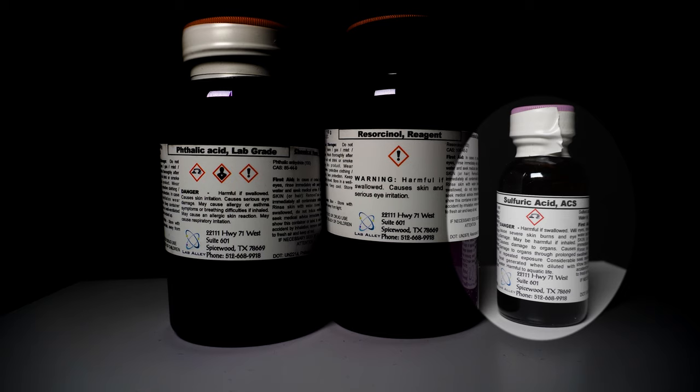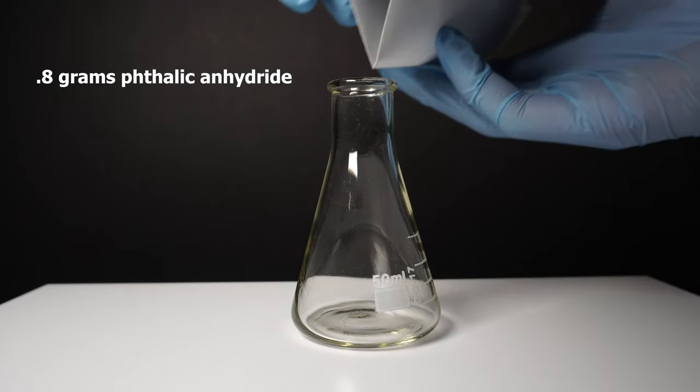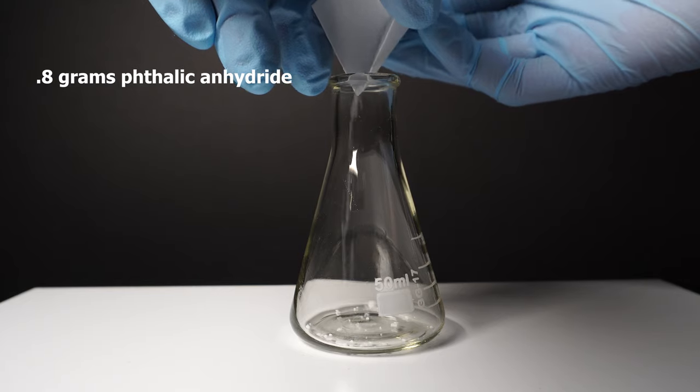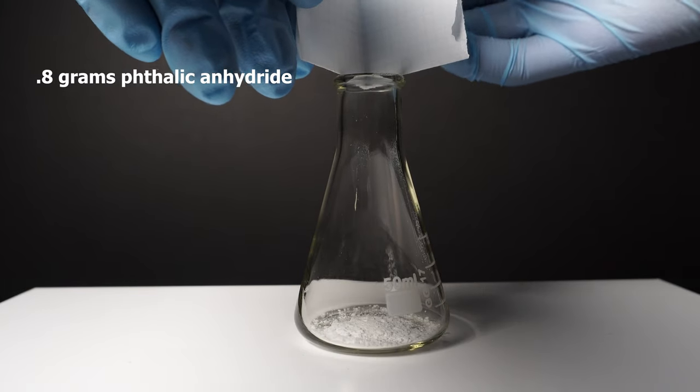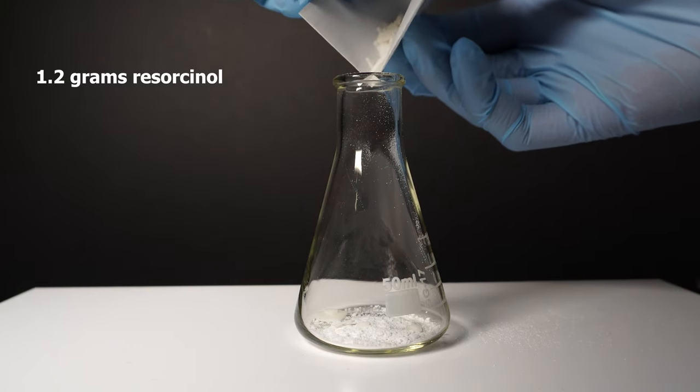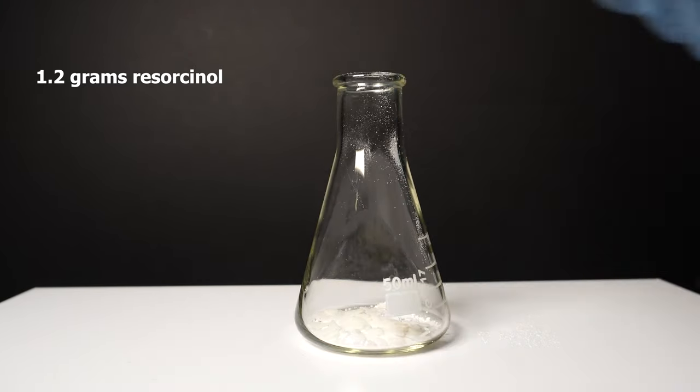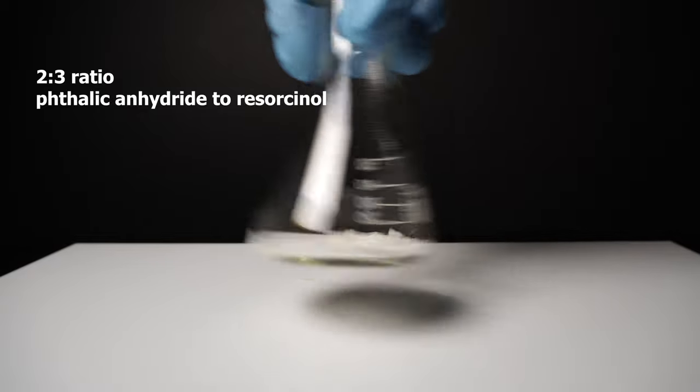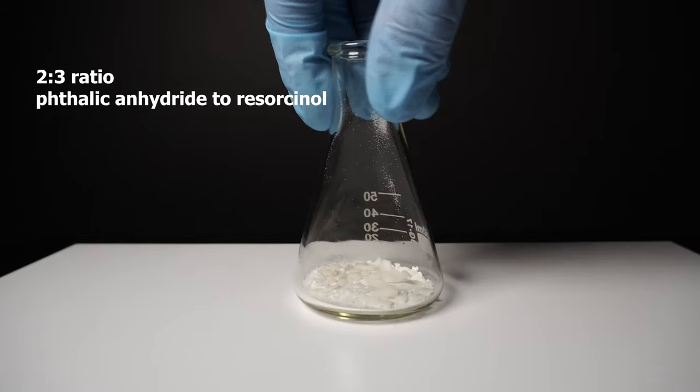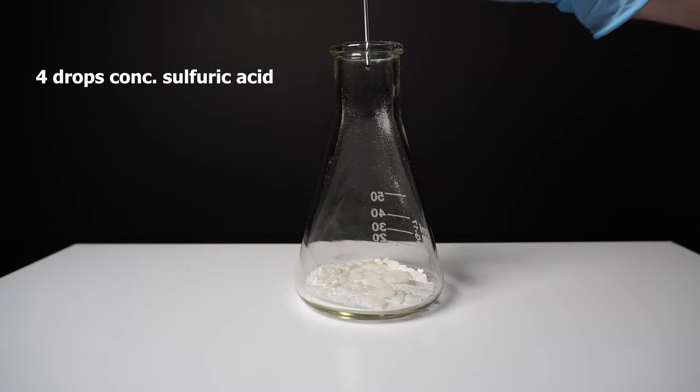However, in most papers I have read, they actually use zinc chloride instead. We start by adding 0.8 grams of phthalic anhydride to a 50 milliliter Erlenmeyer flask, followed by 1.2 grams of resorcinol. The amounts can be scaled up or down depending on how much you want to make. Just make sure to keep about a 2 to 3 ratio of phthalic anhydride to resorcinol. Next we add 3 to 5 drops of concentrated sulfuric acid.